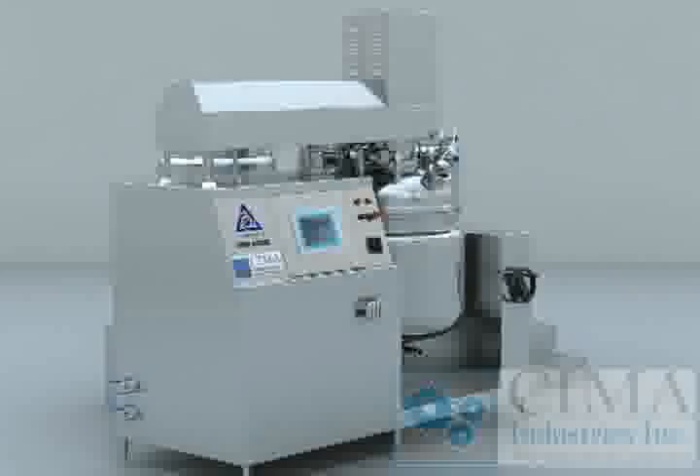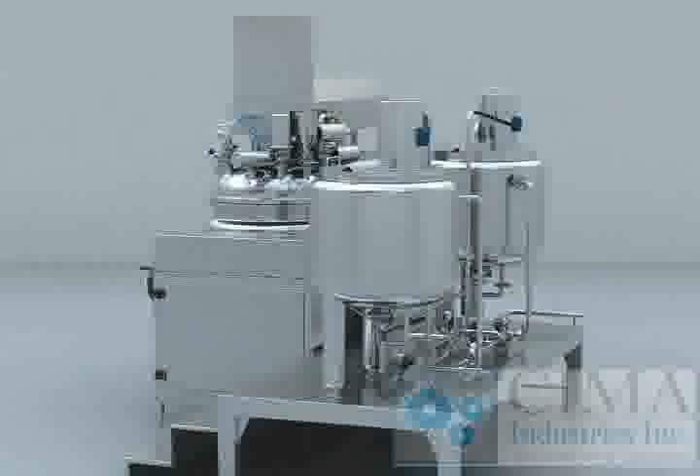The machine is made from SUS316L material. The mirror-finished inside surface is 300 mesh.